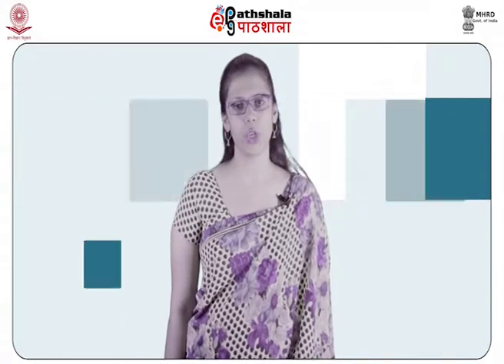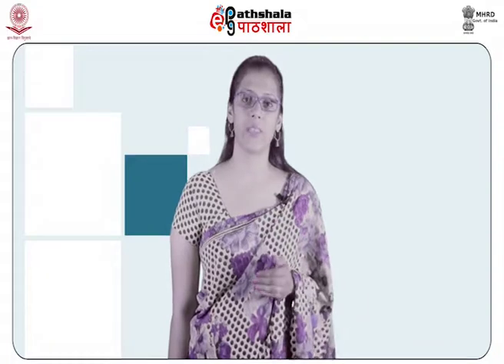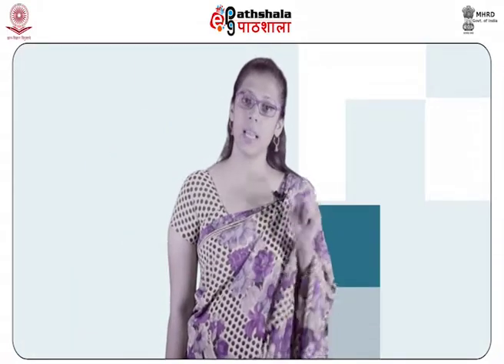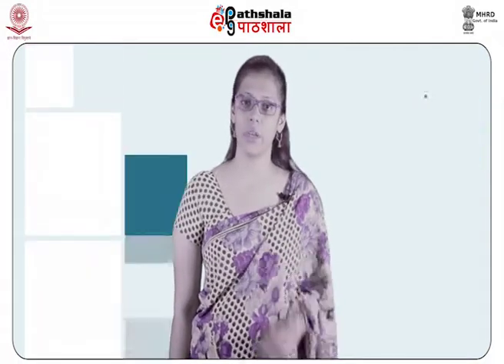The identification of race is most valuable as an investigative tool, but it can also act as a linking tool if a person's hair displays uncommon racial features.